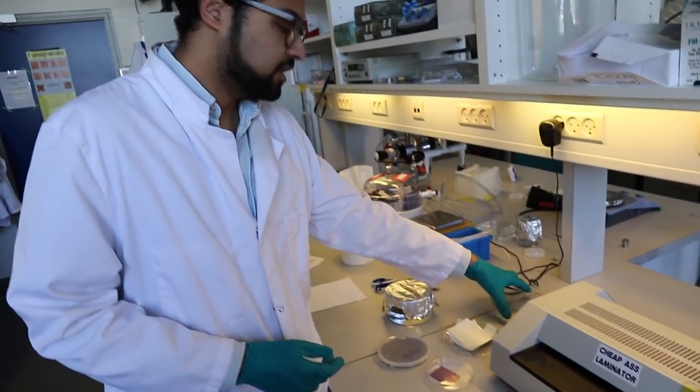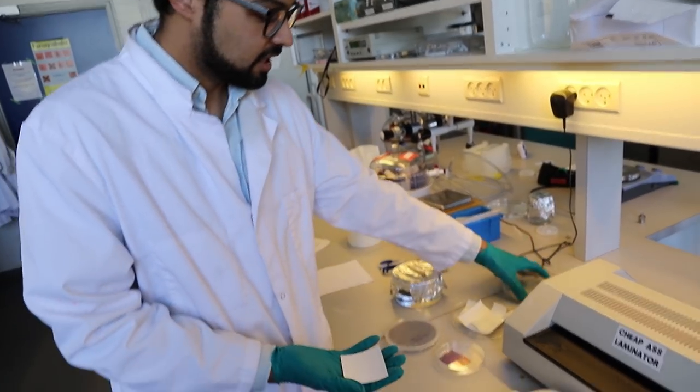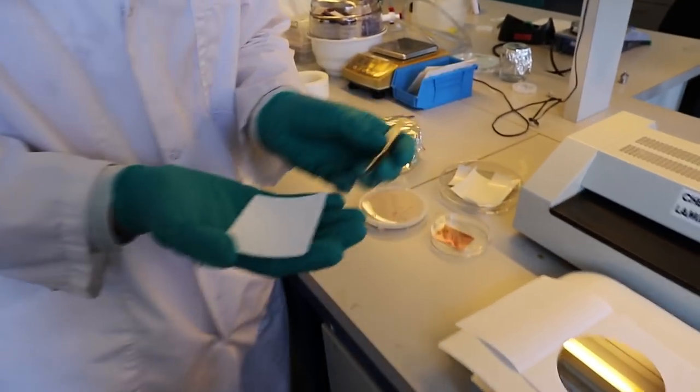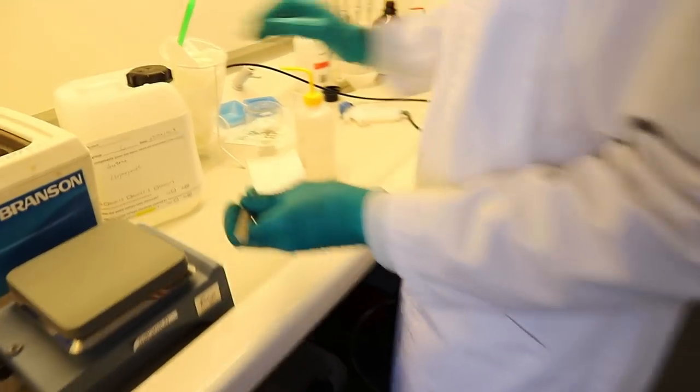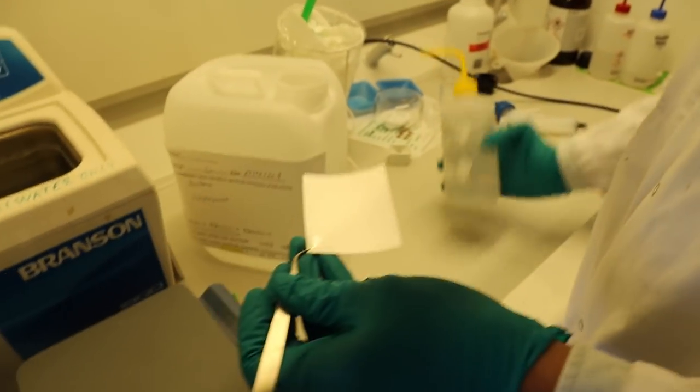Before we get started, we need to clean the PVA foil. So what I do is I basically take one of our foils and go over to the fume hood and clean it with isopropanol.